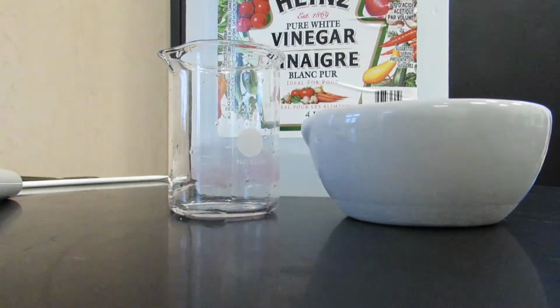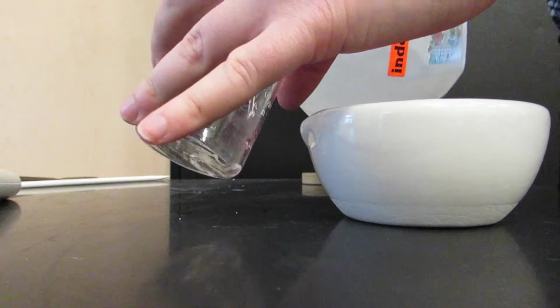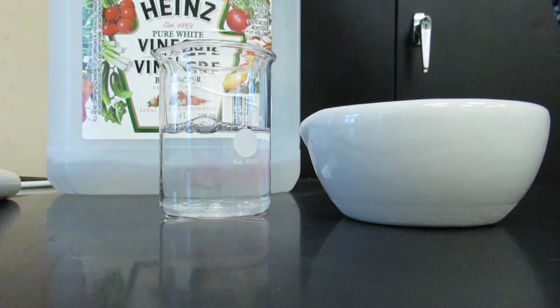For our sixth experiment, we are going to combine vinegar and some of our crushed chalk to see what happens.